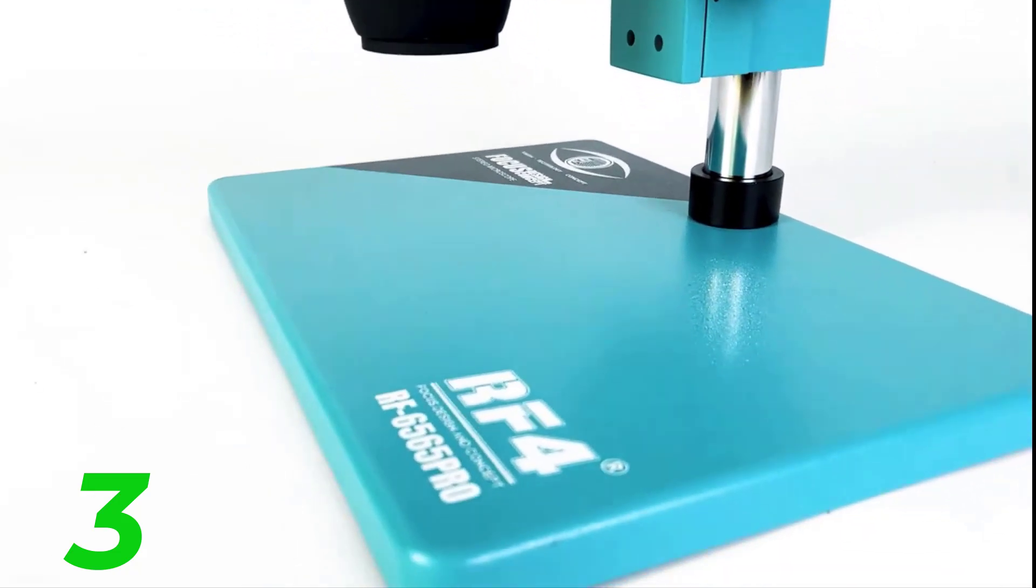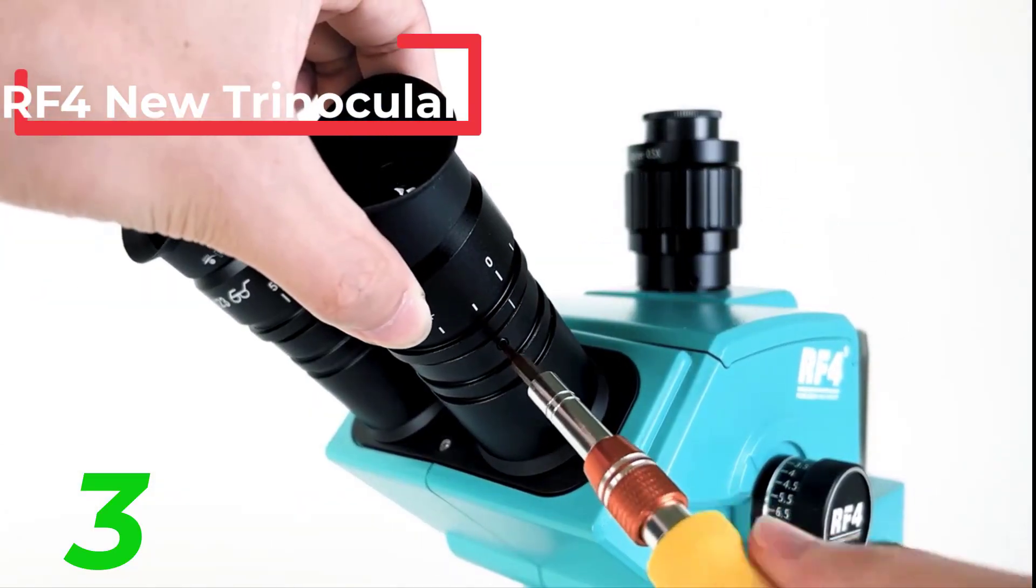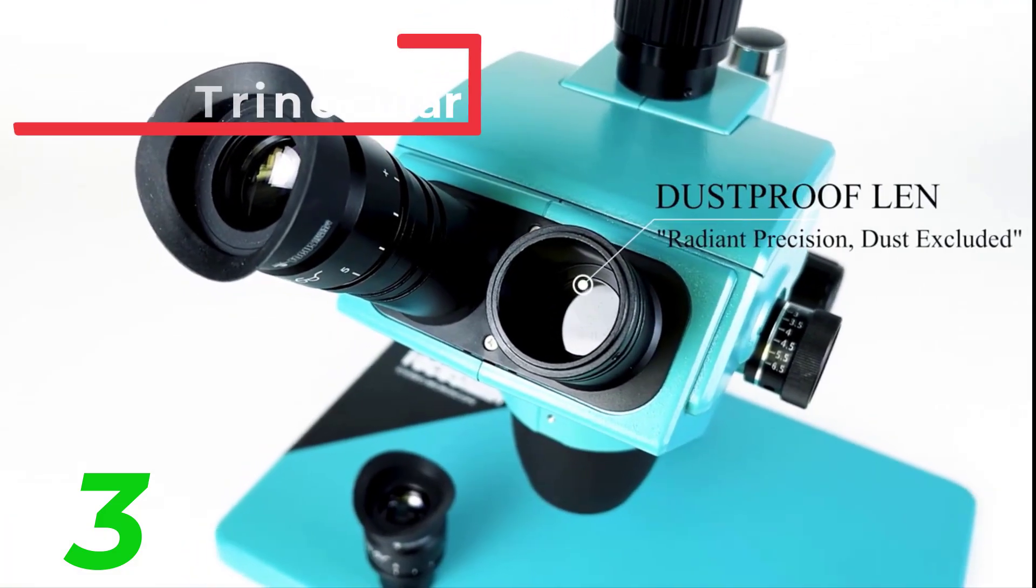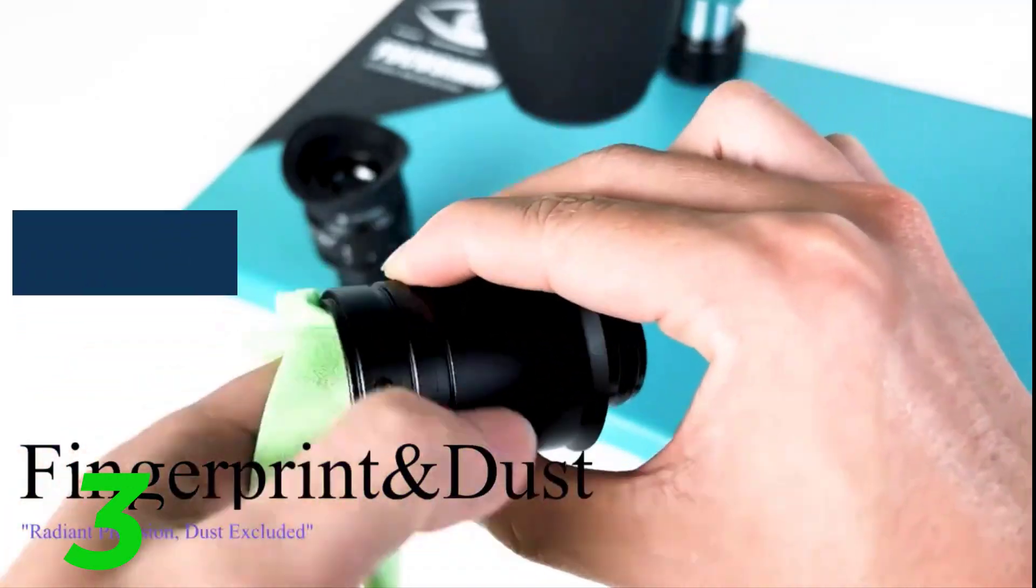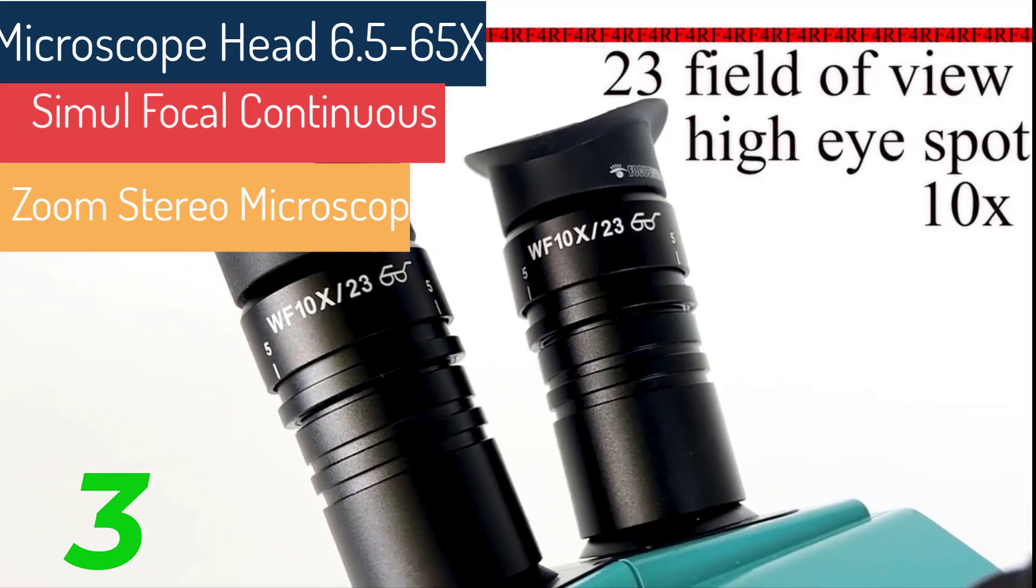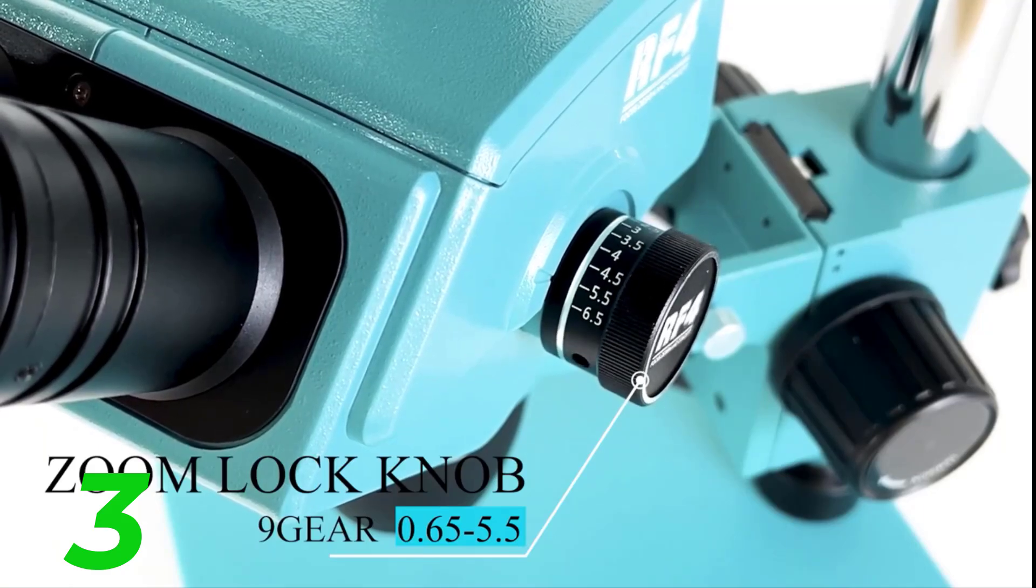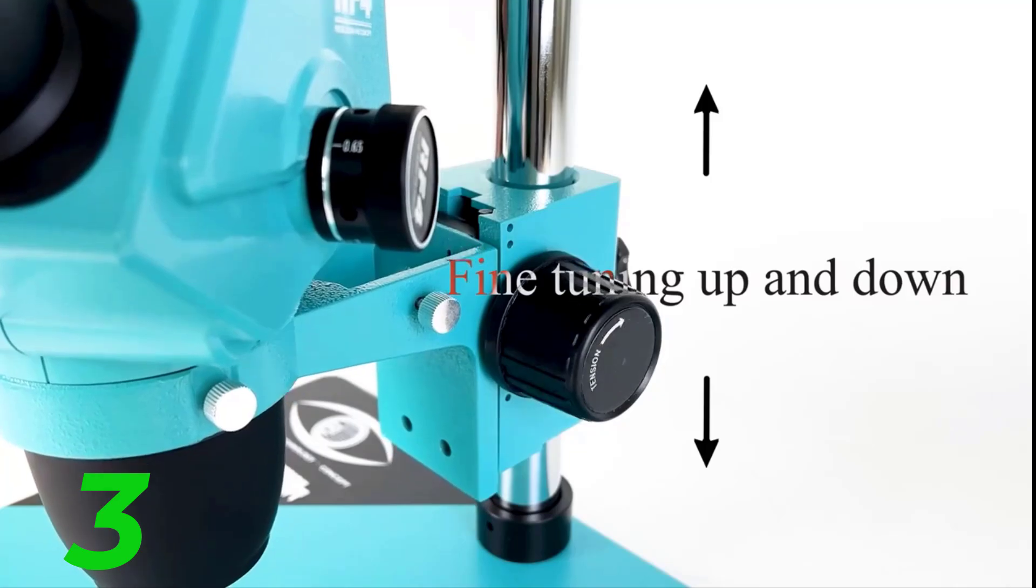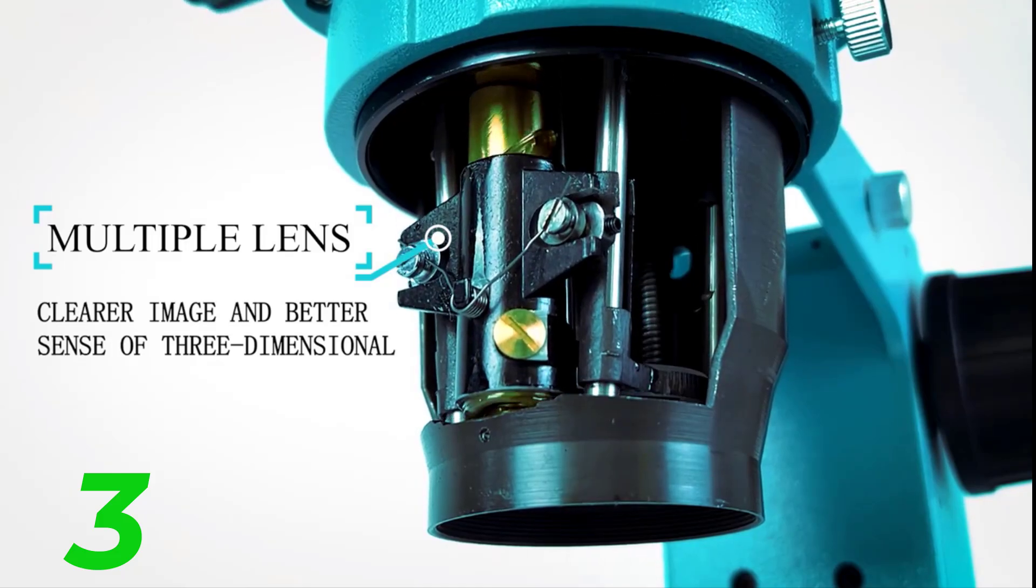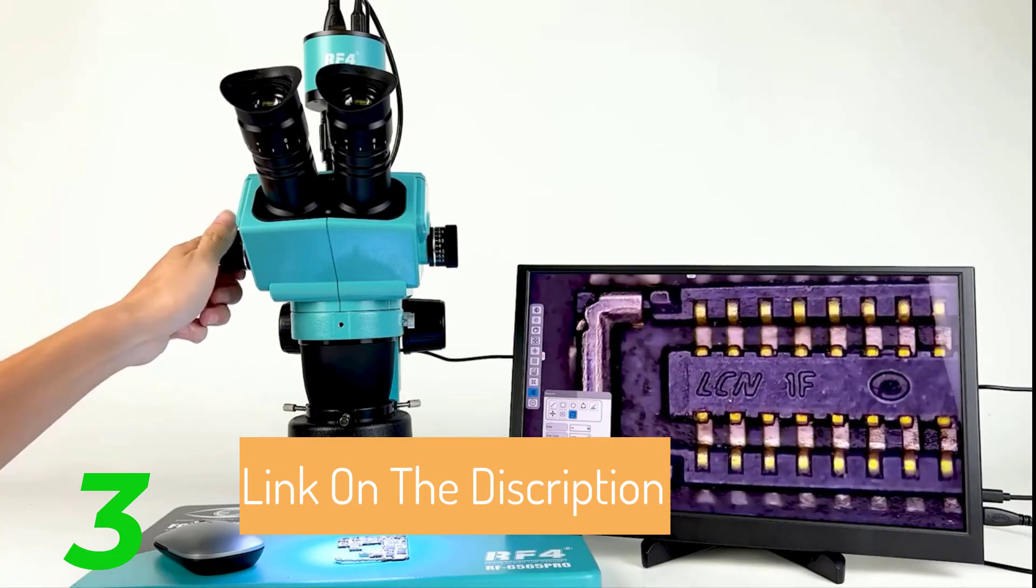The microscope comes with an aluminum carry case offering perfect protection for the device and its accessories, making it an excellent gift for microbiological enthusiasts. With the support of a video capture card, the microscope can take still photos and record videos, enhancing its functionality for documentation and sharing purposes. In summary, the RF6565 P-Rod E2 microscope is a versatile and high-quality instrument suitable for a wide range of scientific applications. Its advanced features, ergonomic design, and included accessories make it a top choice for anyone in need of a reliable and comprehensive microscope.